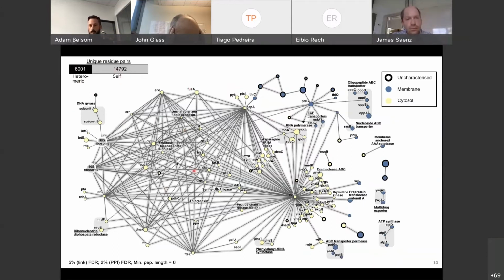We have cytosolic proteins cross-linked together, and we have membrane proteins shown here in blue. What is also nice is that within the membrane proteins, there are several unknown and uncharacterized proteins in our network. And I think Neil is going to talk a bit more about this in the talk that's coming up. But overall, we identified 426 proteins in Syn3A, and we identified 386 with cross-links.